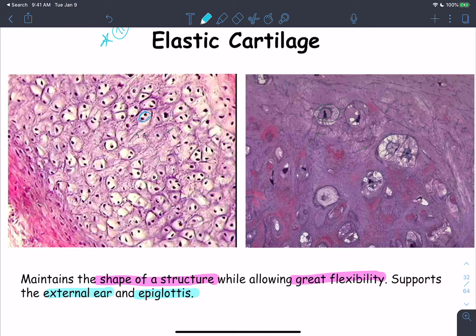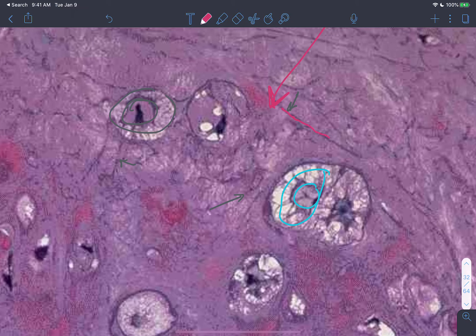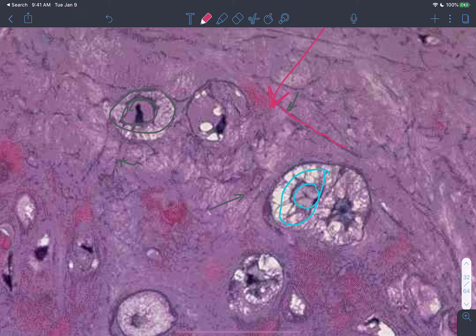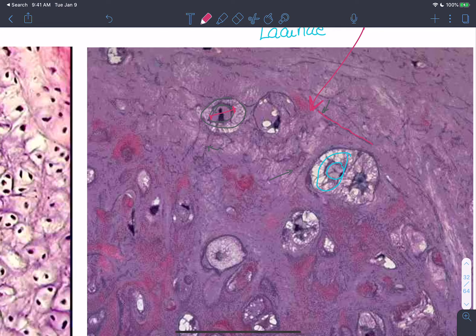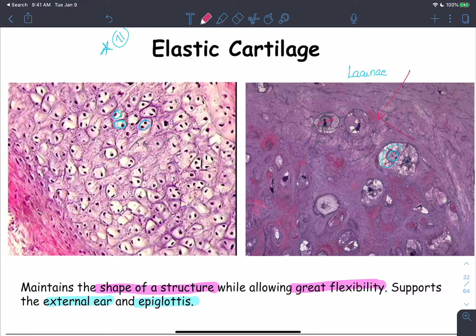Another type of cartilage: again, we identify cartilage by chondrocytes within lacunae, then differentiate types by the fibers in the matrix. Looking closely, you can see thin, darkly stained long fibers. To confirm they are thin, compare the fiber diameter to the diameter of a nearby cell — a much smaller diameter indicates thin fibers. These thin, darkly stained long fibers are elastic fibers.